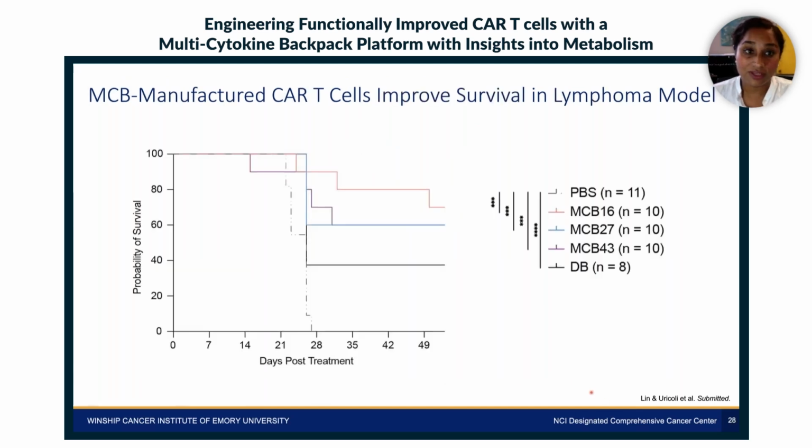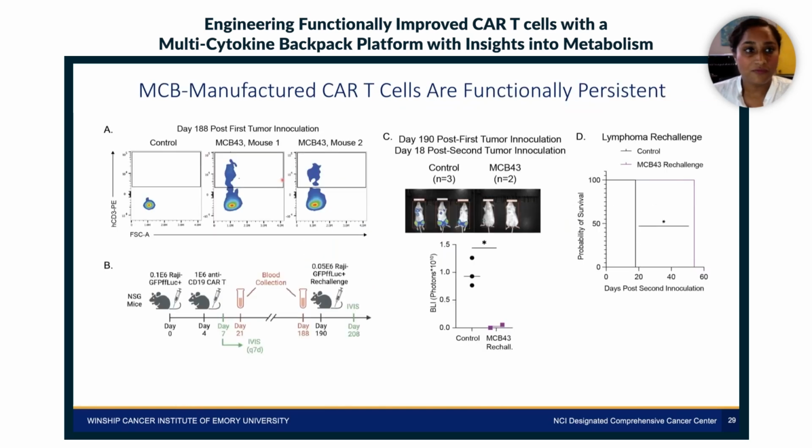If we look at the survival curve, we can see that our MCB manufactured CAR T cells, which are in here, have improved long-term survival compared to untreated or Dynabead treated mice. We had a few mice that were long-term survivors in the MCB treated conditions.